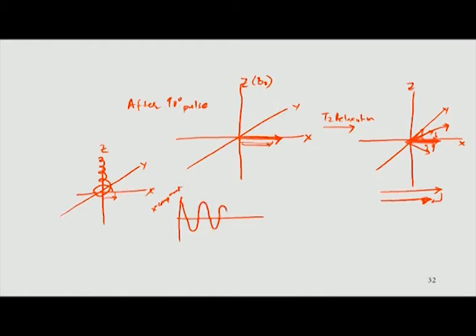But remember, its amplitude is also slowly decreasing, and that decrease is coming from this picture here. You see it is shrinking along the x axis, and finally it is 0. So, our FID is nothing but a projection of this magnetization along the x axis.